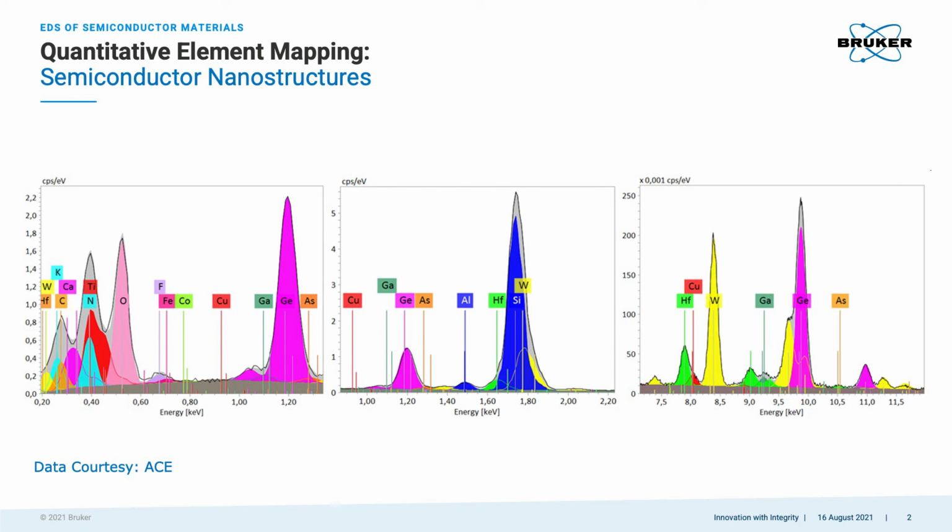So I've seen that hafnium, tungsten, and silicon, and also tantalum and copper are well deconvoluted already with a few iteration steps, with the so-called online deconvolution right during the measurement. But silicon and oxygen sometimes need a proper quantification step. And as I already mentioned, titanium and nitrogen sort of sit on top of each other, but can nicely and easily be deconvoluted.